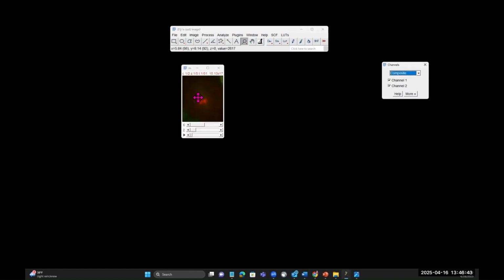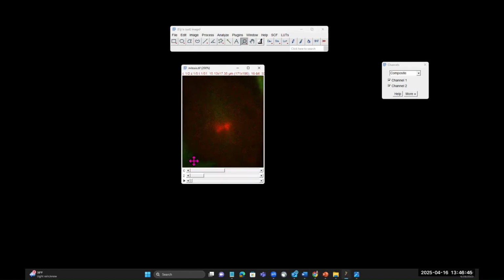So when you see an image like this, you can see, okay, you've got C here, meaning there are 2 channels. You have Z, so this is a Z stack. And you've got this play tool. So this is basically like a time-lapse image. So this whole image here is called a hyperstack. Okay, so a hyperstack is not just a plain stack, but it is a hyperstack.